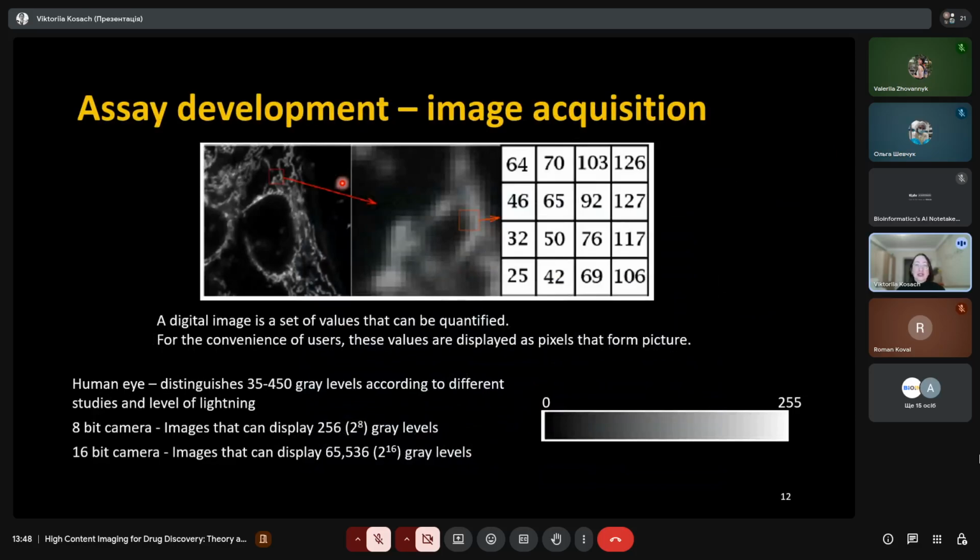When you have all of this established, you are going to your confocal microscope for image acquisition. I think you may know that image acquisition is just a digital value from the light emitted and detected by the detector or camera on the microscope, in gray values, and these digital parameters are quantifiable. So each pixel has its own number of gray value.